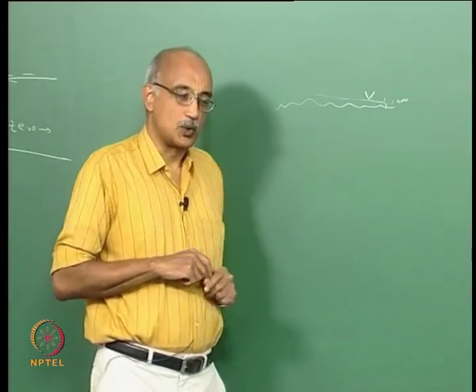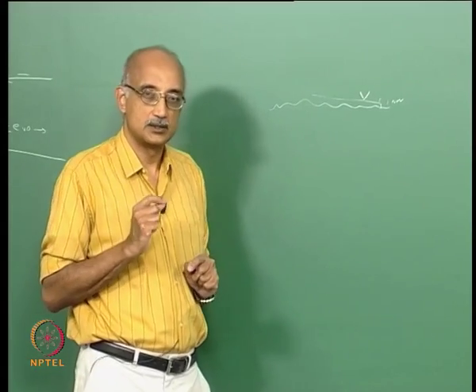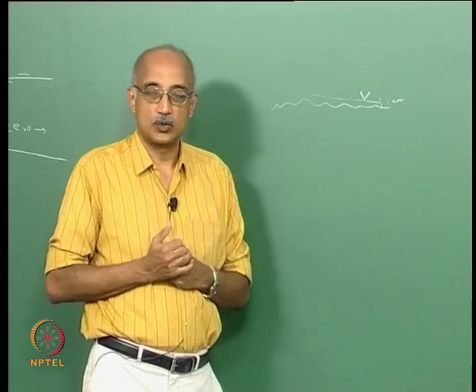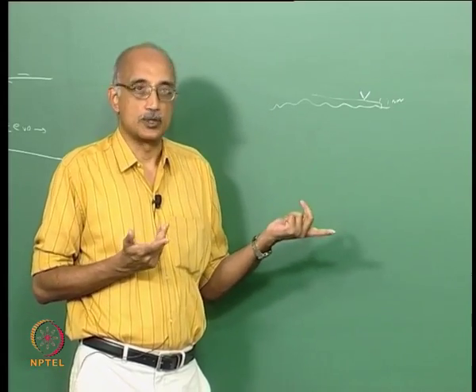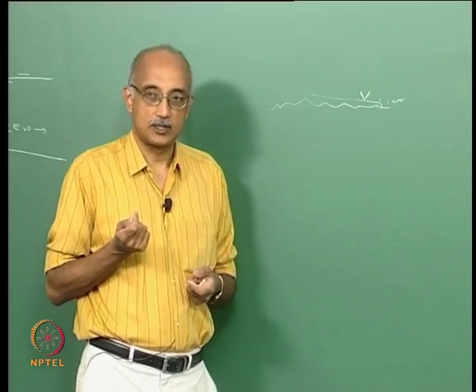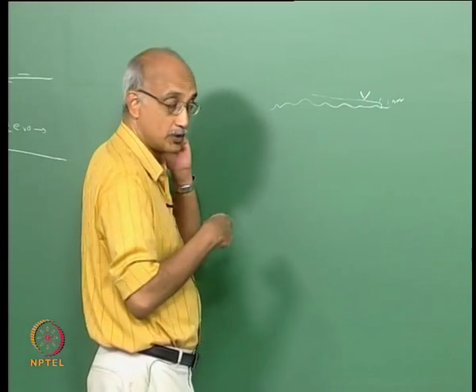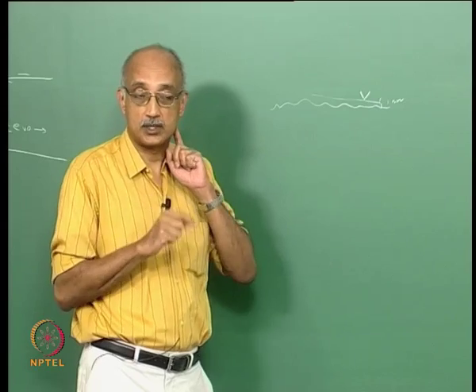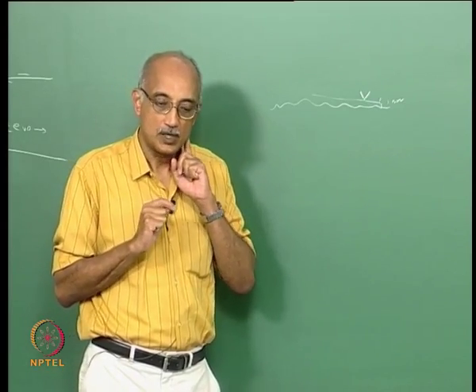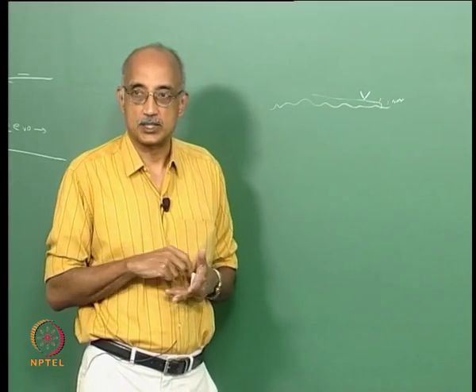But how do you measure this force? Now what is the problem with measuring that force? It's very, very weak. If you really talk about the magnitude of the force, this is going to be in piconewtons. So how do you measure that? That was really the challenge that was overcome in the invention back in the 80s, and the atomic force microscope, which was invented in 86, really solved it in a unique fashion by saying that we'll make use of the Cantilever Principle essentially.